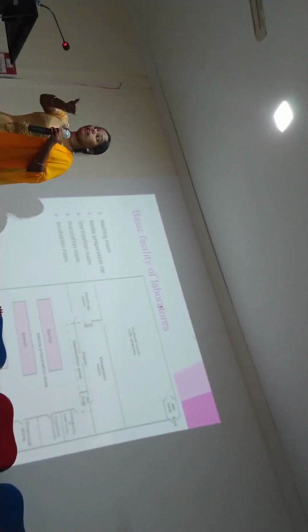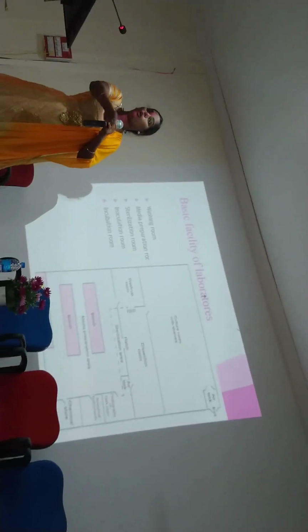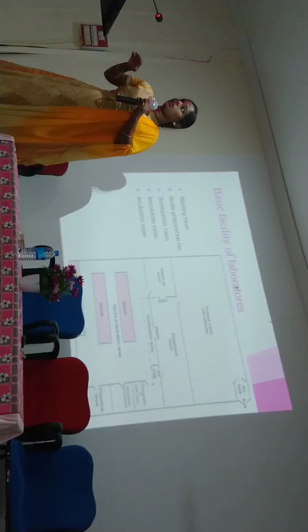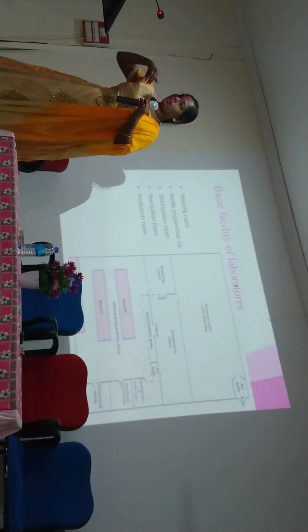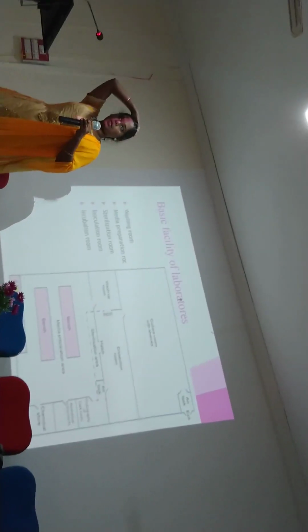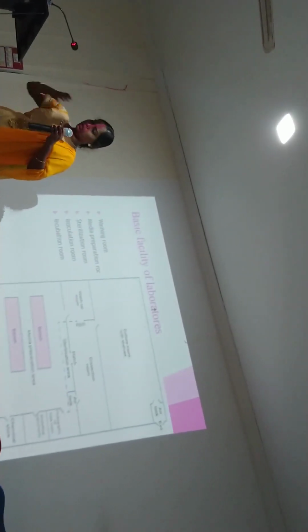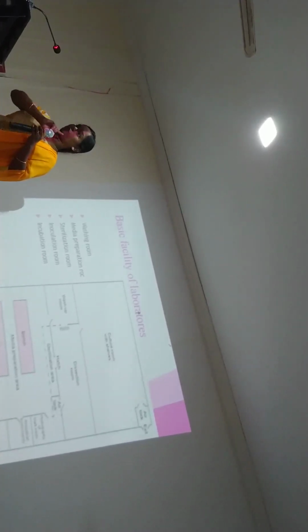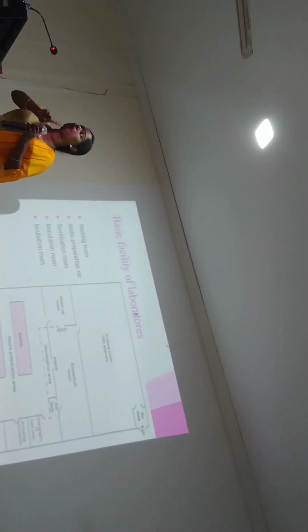Those are public traffic areas where we can go in and out. But when we are entering the inoculation chamber or the culture room, we have to maintain protocols. When we are entering, we have to wear a head mask, mouth mask, gloves and aprons, and then enter. If not, don't enter. It is not like a public traffic area.